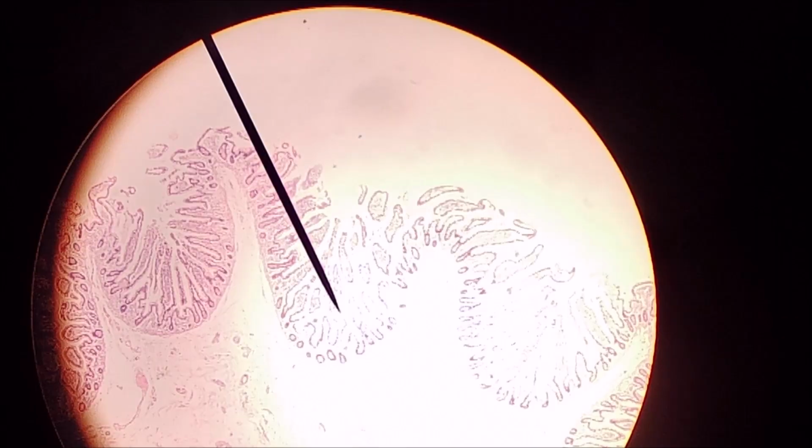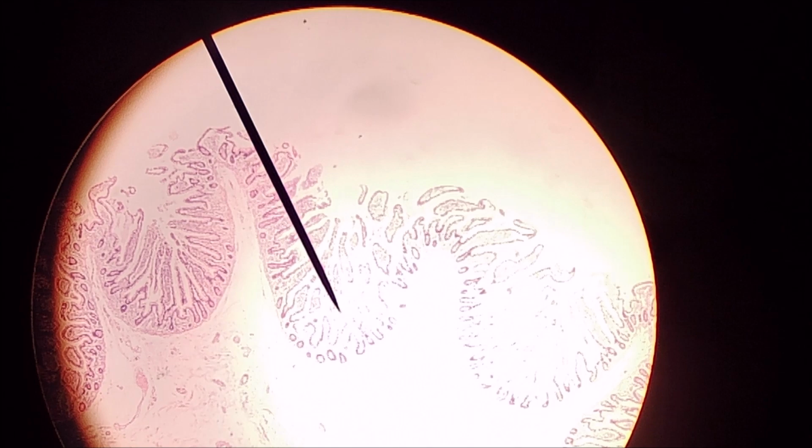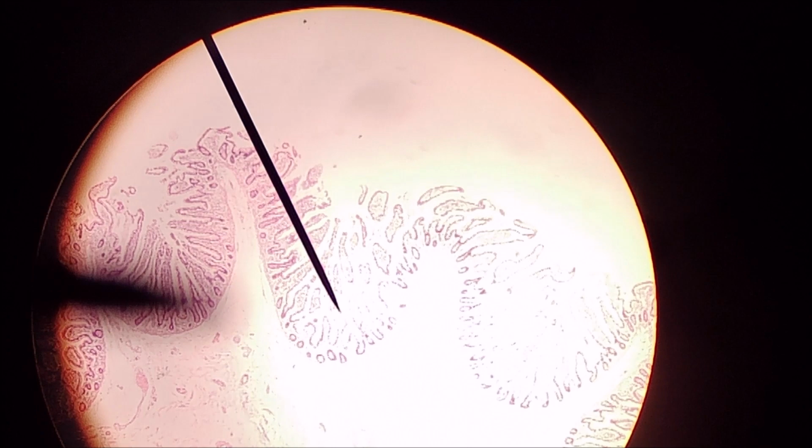What you see here is the intestines, and what we're going to look at is simple columnar epithelium. Now, we've got a little white balance issue here, but what you see on this side, this is a villus, and there are smaller villi here. Lining these villi, these are going to be increasing surface area, being that this is the intestine, we've had these crazy undulations and then inner undulations. Lining these villi is where you're going to find these simple columnar epithelium.